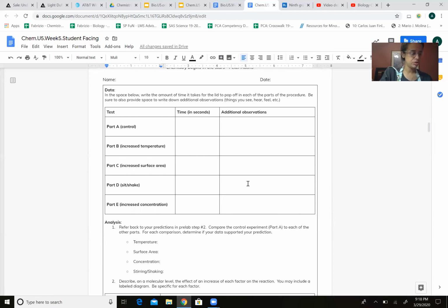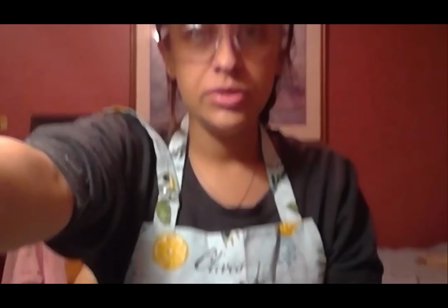So we're gonna do our control first. So I already have room temperature water in here. So let me stop sharing my screen so you guys can get a full-on view of this. Should have had these prepared ahead of time.